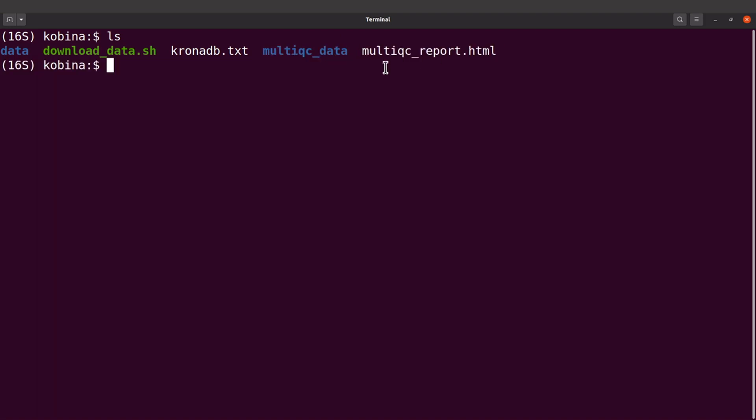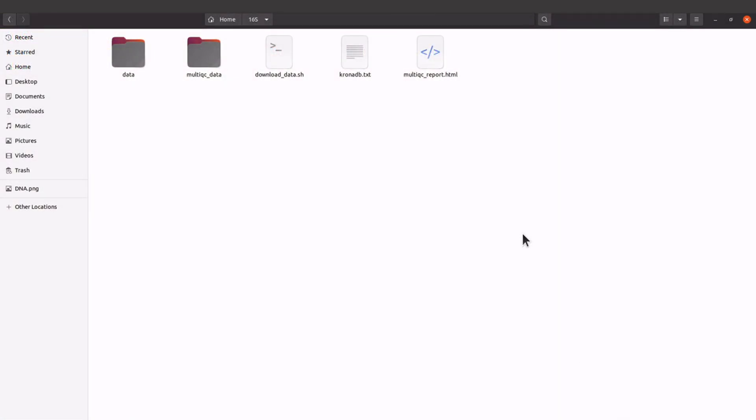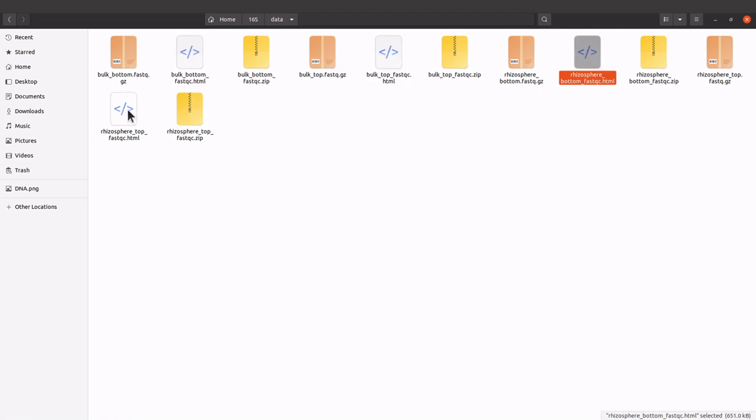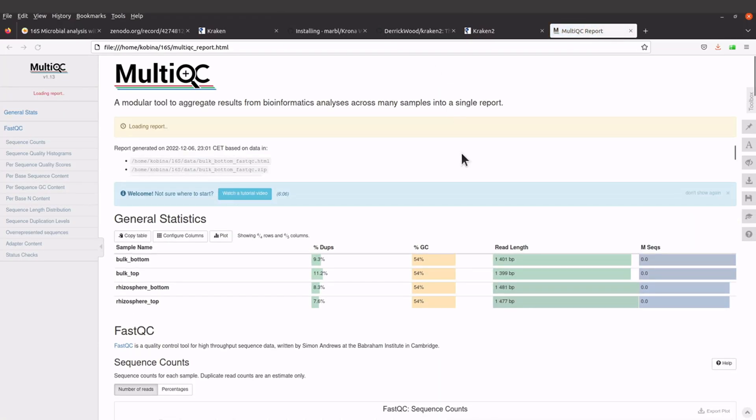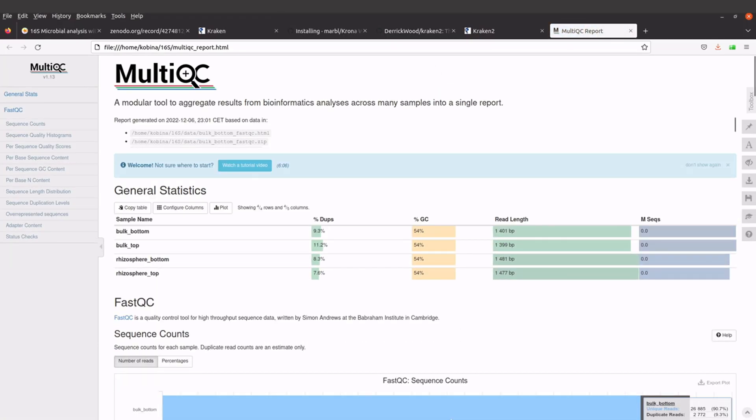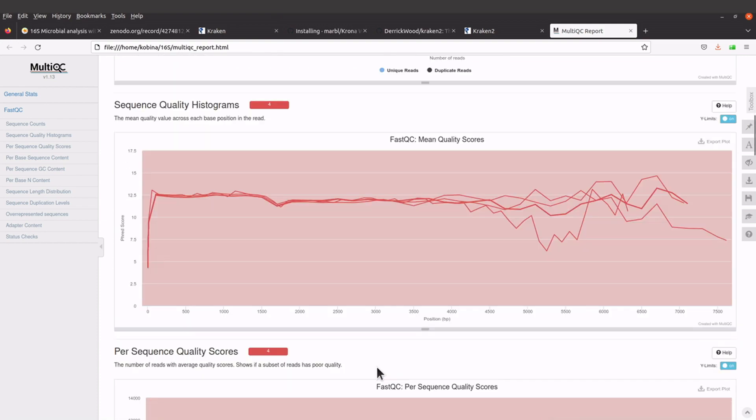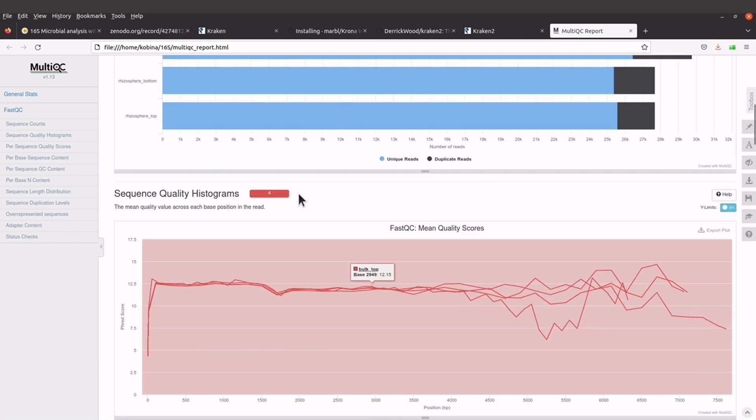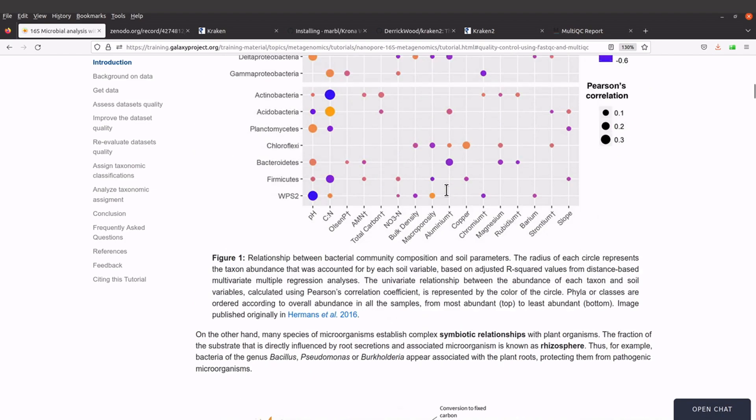This is the MultiQC report. If you want to check the individual reports, you can find them in the data directory. There are four of them. We're going to use the MultiQC report because it has all the reports. The report has been opened, so you can scroll through and check the plots. Explanation for this report can be found on the Galaxy tutorial page. When you're there, go to the quality control section and you'll find explanations there.